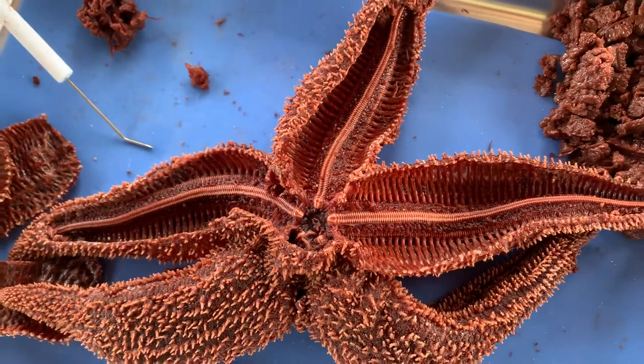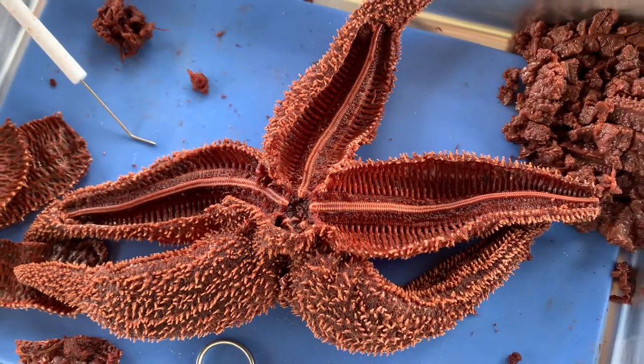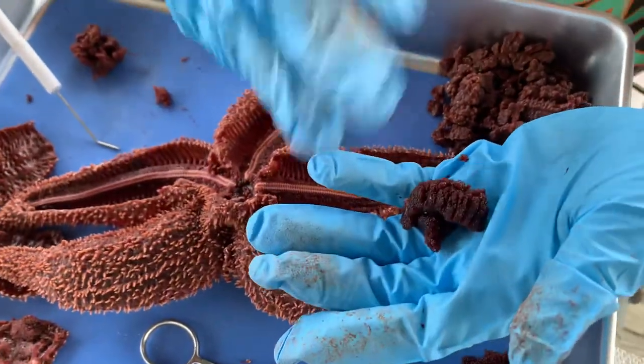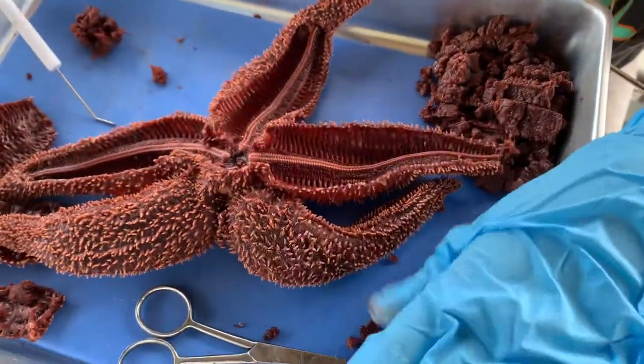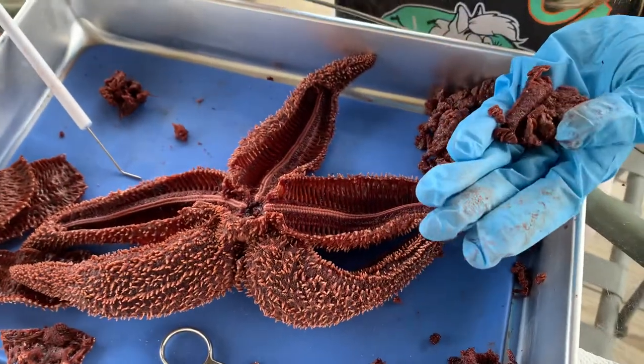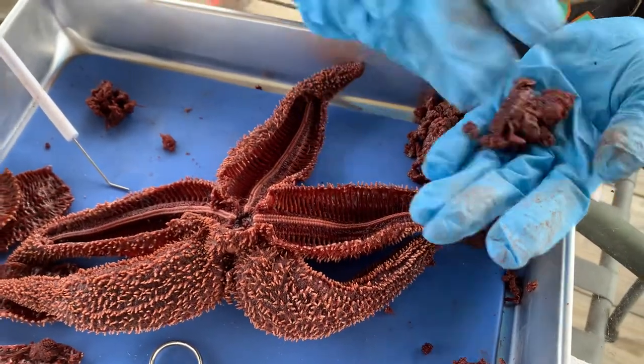And then the gonads, the reproductive organs in each arm, and the hepatic ceca, the paradigestive glands in each arm.